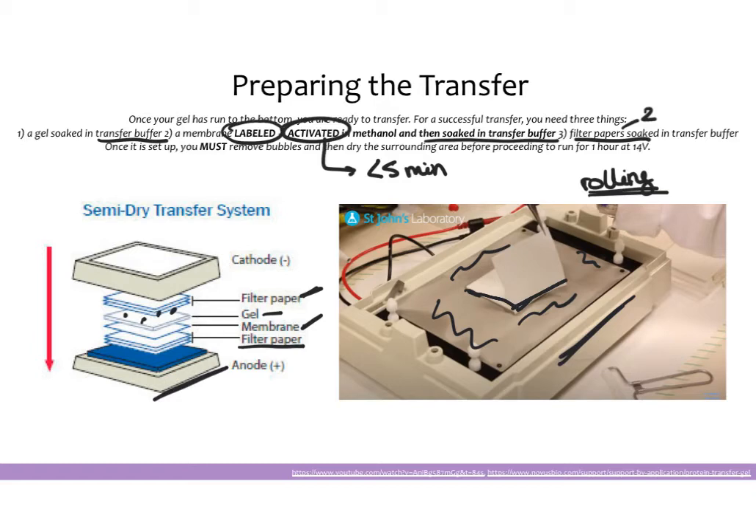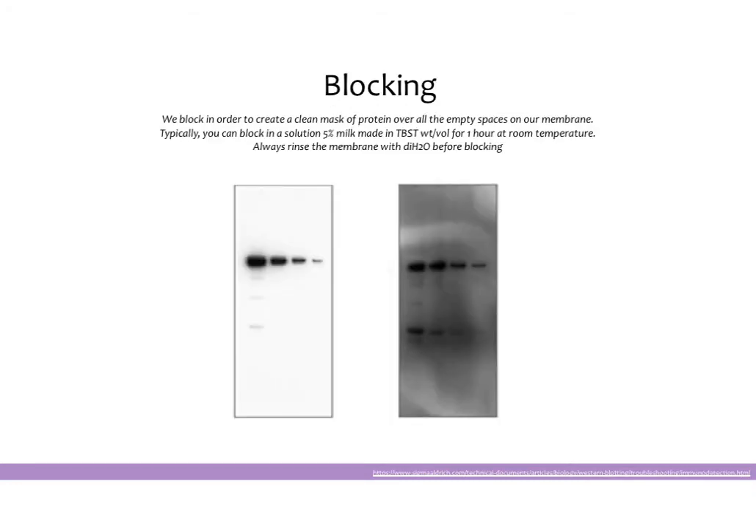Once the sandwich is dry, put the machine back together and run for one hour at 14 volts. One hour is important — don't overrun this, as proteins will start running through the membrane into the filter paper. Check the transfer machine a minute or two after starting it, because sometimes if the surface isn't quite dry enough it can start and then stop. Once the transfer is over, open up the machine and check your membrane — you will know the transfer worked by looking at your ladder, which should have transferred onto the membrane. If it has, throw away the gel and move forward with your membrane.